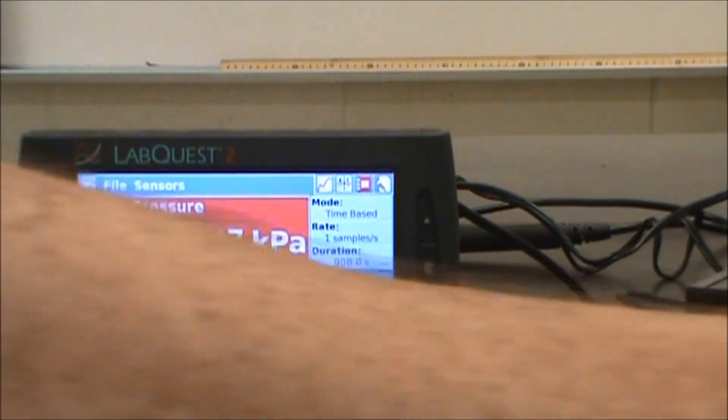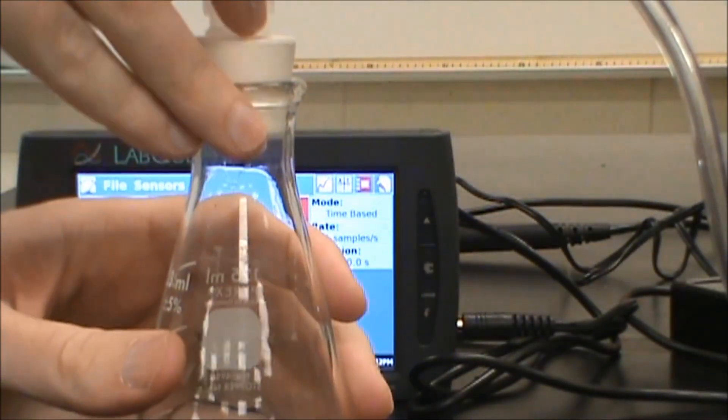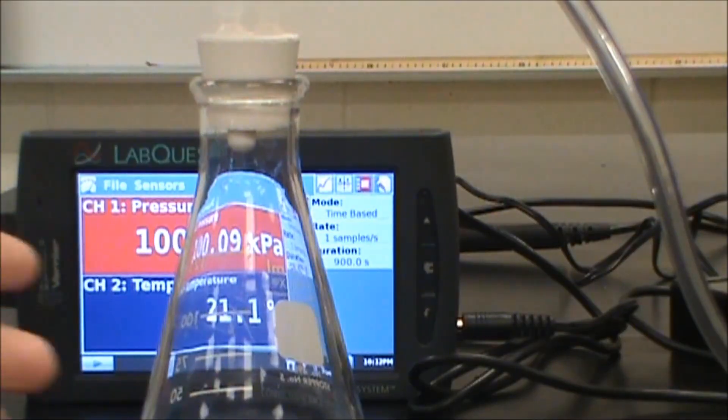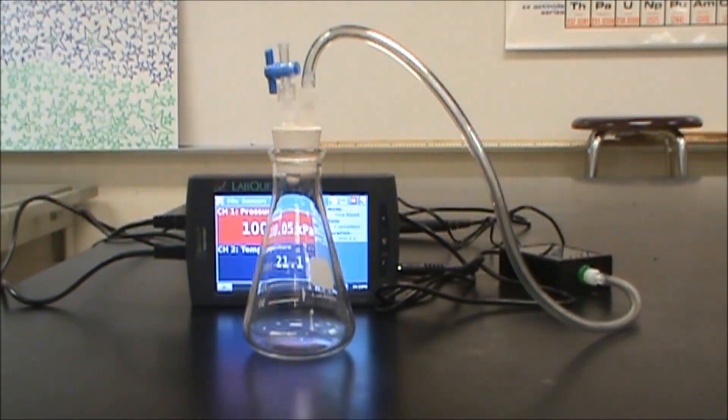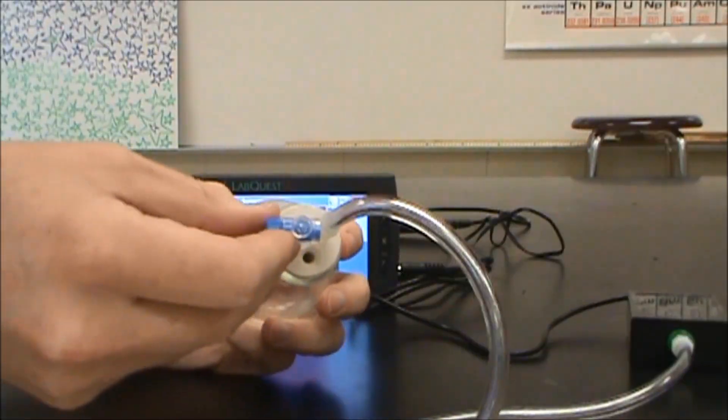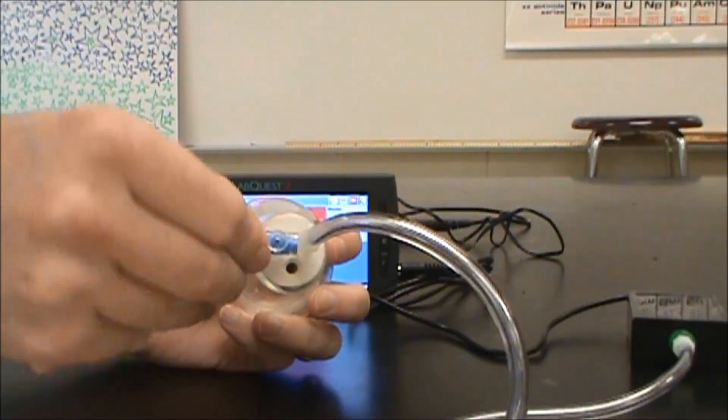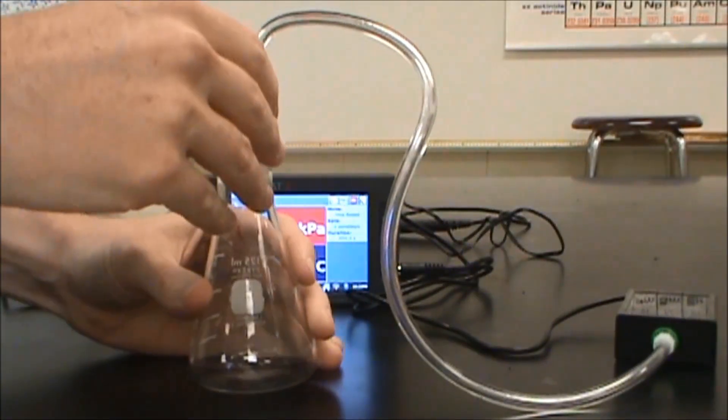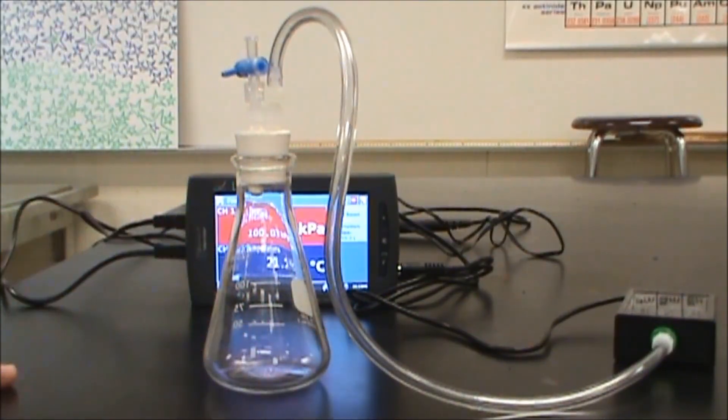I have the pressure hooked up to this. This currently is just an Erlenmeyer flask that is hooked up to my sensor here. On here this will close or open this to the atmosphere, so I'm going to close this so that all of the gas inside of here and in the tubing is giving me the pressure and nothing else.